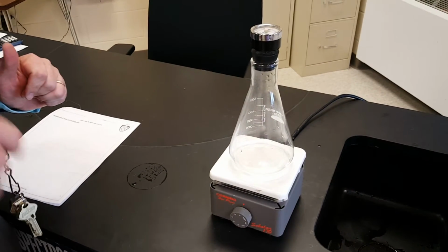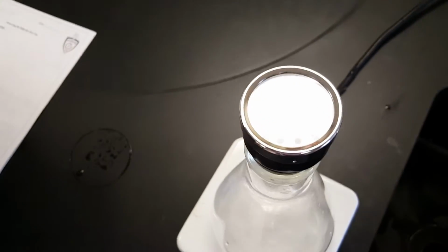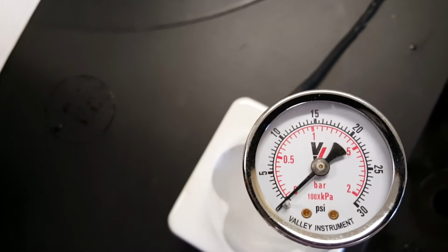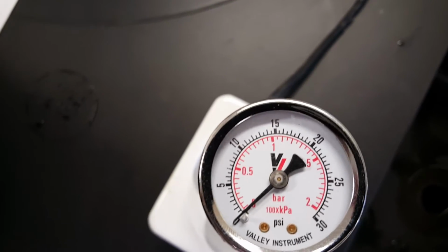You wait for no more than 2 minutes. So you've got to watch the clock carefully. Somebody's got to be clocking it and somebody's got to be watching it. Hopefully you'll see it going up. It's going to take about a minute before we see any change, and then all of a sudden it's going to go up. And we're measuring in the pascals or the kilopascals.